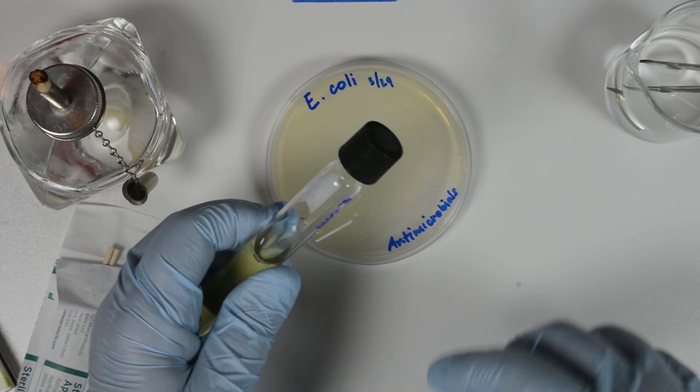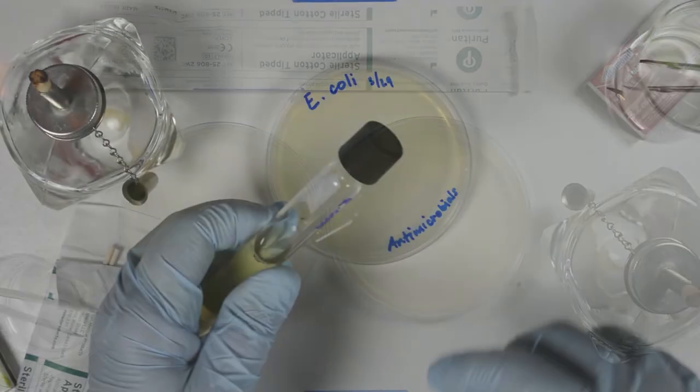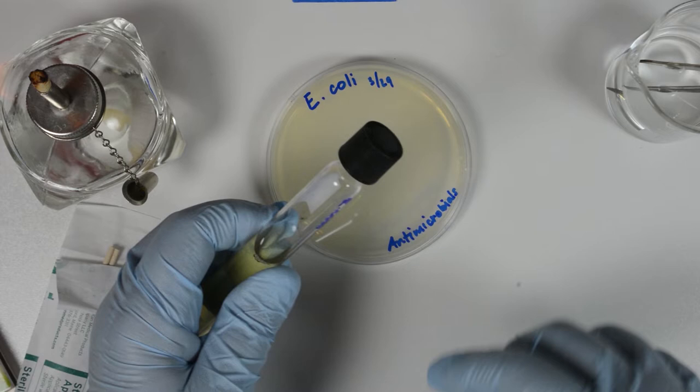We begin with a pure culture of a bacterium that we will inoculate onto the agar plate containing 4 mm deep of Mueller-Hinton culture medium. There is one standardized way that we can inoculate the plates according to the American Microbiological Society. We use a broth culture diluted to match a 0.5 McFarlane turbidity standard to inoculate the plates. The culture should be actively growing.